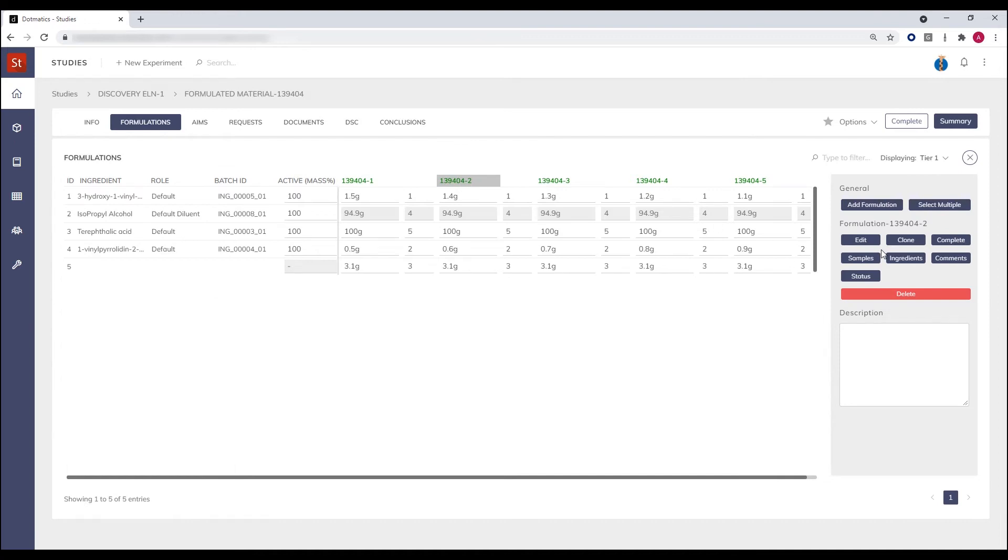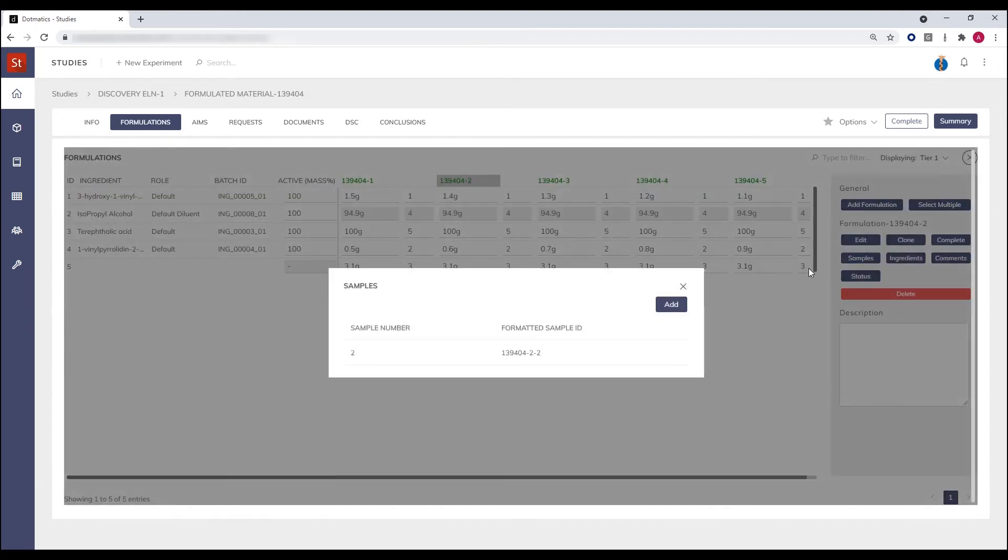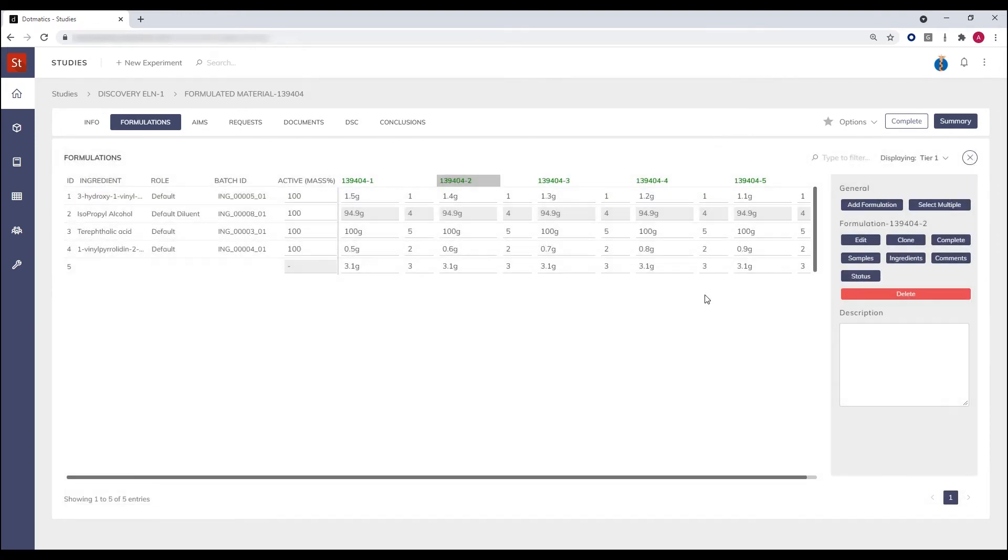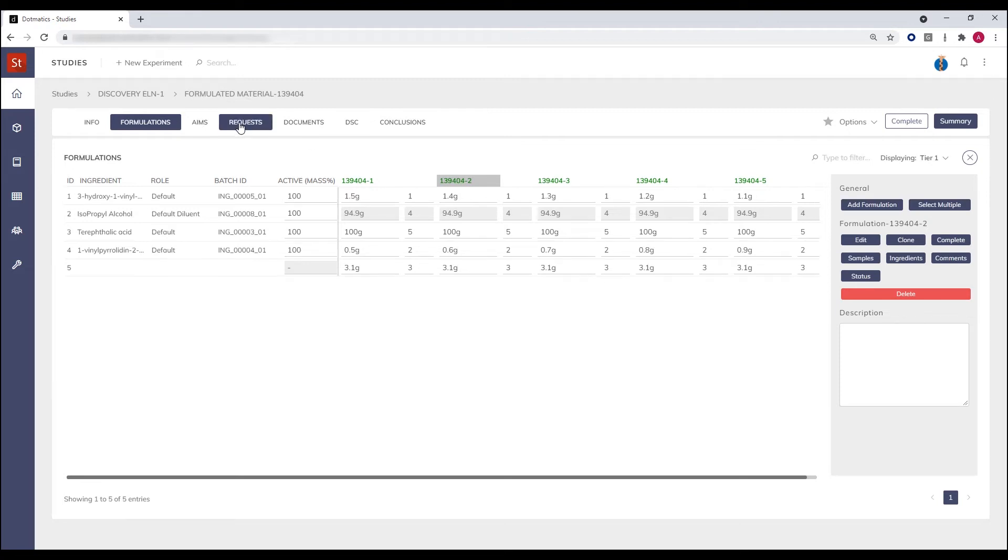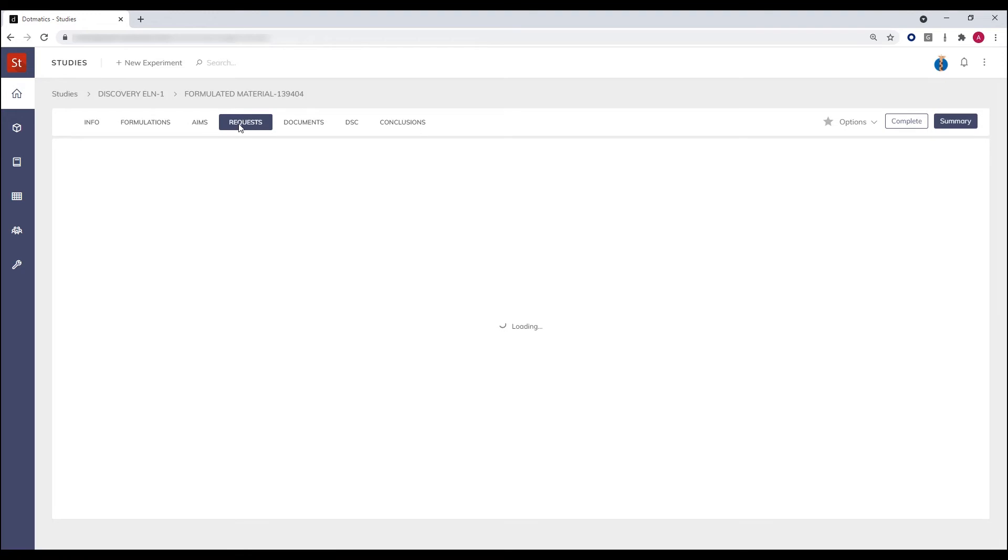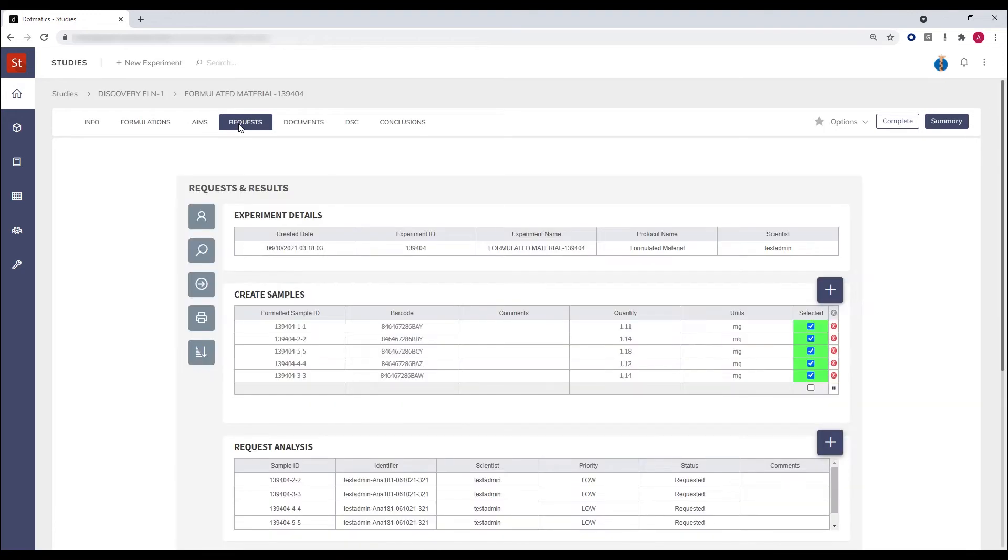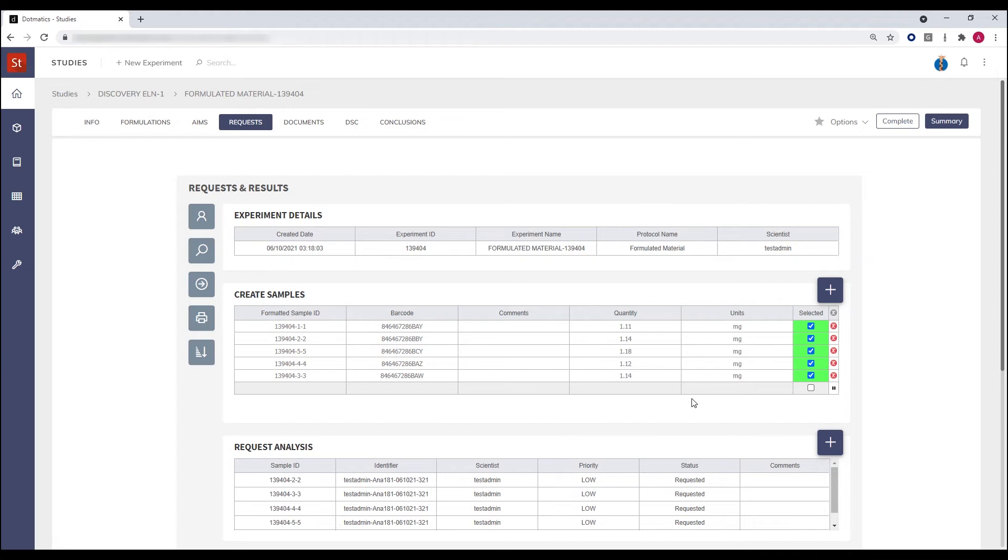Once the samples have been created, the scientist can then choose to perform tasks on them. They can make requests; on this occasion they can either perform the task themselves or make a request from a colleague. So the created samples have been selected and sent off to a colleague to perform some DSC testing.